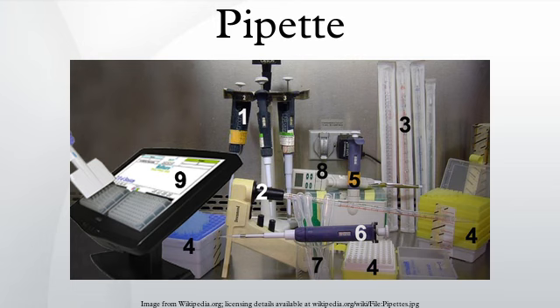Air displacement micropipettes are a type of adjustable micropipette that measure volumes between about 0.1 microliter and 1,000 microliters. These pipettes require disposable tips that come in contact with the fluid. The 4 standard sizes of micropipettes correspond to 4 different disposable tip colors. These pipettes operate by piston-driven air displacement.